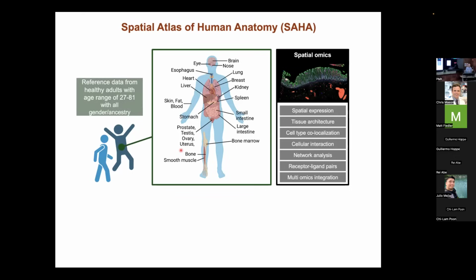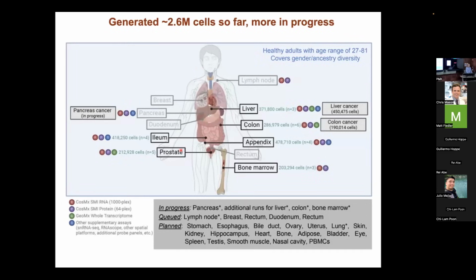Cool. The other thing to point out is all the techniques that I showed you are really being done on FFPE. So, not perfect tissues. Some of these are in frozens, but most are not. Thanks. Okay.